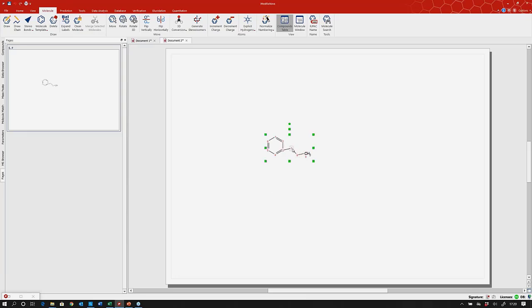So if we hover over number 7 and click the letter O. Okay. So guys, if you hover over number 7 and you click the letter O, hopefully you get an oxygen on there. Okay. So anyway, go to the preferences and molecule.